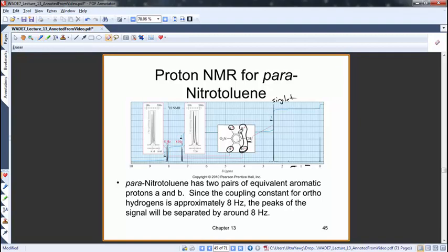If you count them separately, if I say 1, 2, 3, that counts. You would count 2 neighbors, but the neighbor that you're counting is exactly the same due to the symmetry in the molecule. So you're really counting the same thing twice, and so that's why, even though it seems confusing, this HB and this HB should be counted separately, it's the same neighbor getting counted because of molecular symmetry. And so HA collectively has one neighbor, and HB collectively has one neighbor.